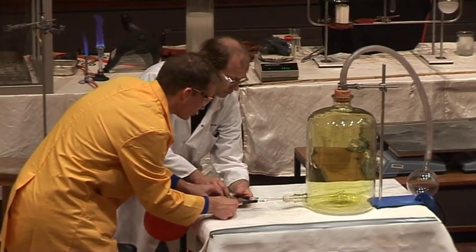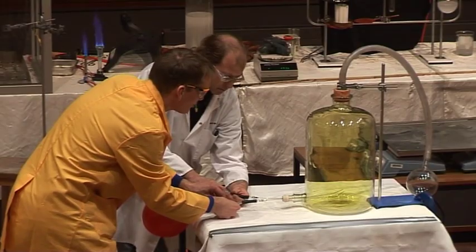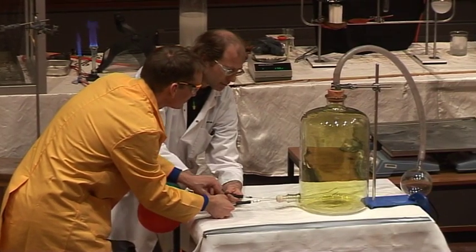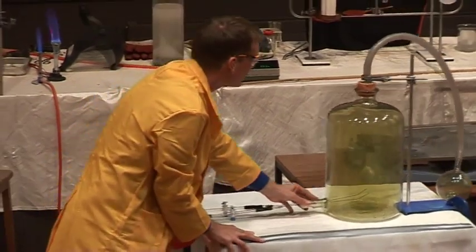Okay, and well, I just need the nozzles to meet. That's good. So in a minute, I'm going to open mine, and Chris is going to open his. So if you open yours, then Chris. Oops. Try again. Okay, and yours off. There we are. So mine is now burning. Just leave yours there. That's fine. But there is no carbon being formed. It's only from the acetylene there. The hydrogen is burning by itself. We can have that one out, thank you.